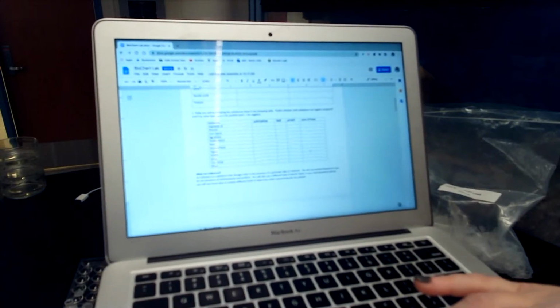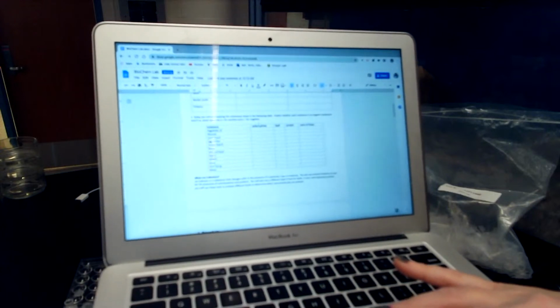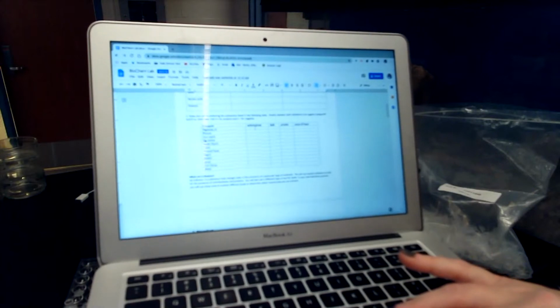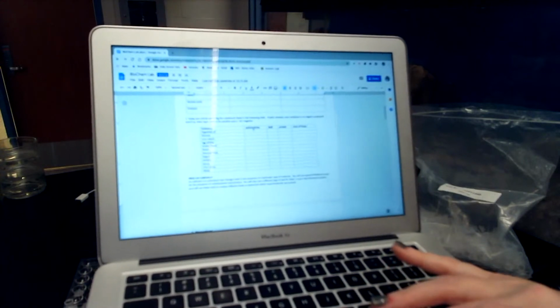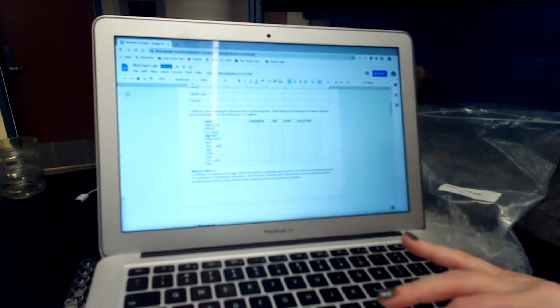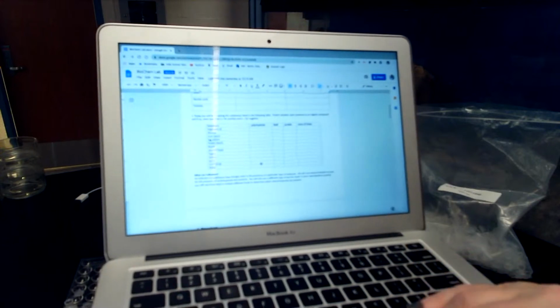All right. So a little pre-lab prediction. And like I said, this video is just going to be on carbohydrates. So take a moment, pause again, to answer if you think they're going to test positive or not for the presence of carbohydrates. We have 11 different types of foods here. Check off a plus if you think it will test positive for carbohydrates and a negative if not.